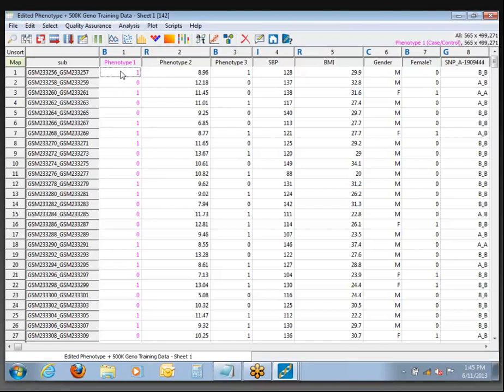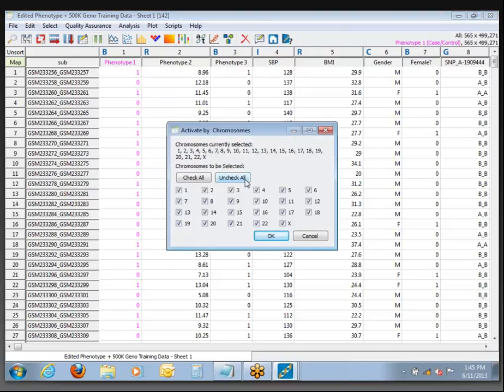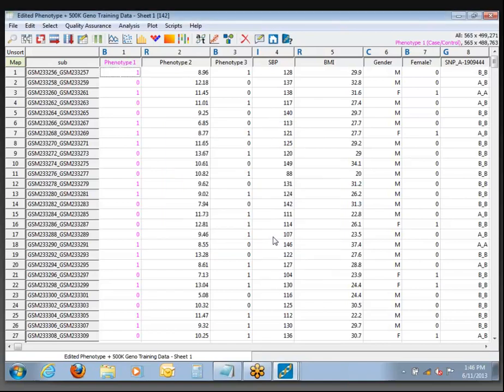If you didn't follow along with that edit earlier, that's fine — you can just use Phenotype 3 or one of the others. Once that is set, the next thing we're going to do is turn off the X chromosome again — we're going to use the regular association testing that doesn't adjust for X today. I just used the shortcut button here above column 1 that looks like white and green columns — the Activate by Chromosome dialog — to turn off X.